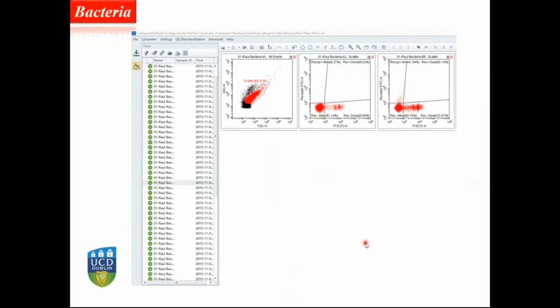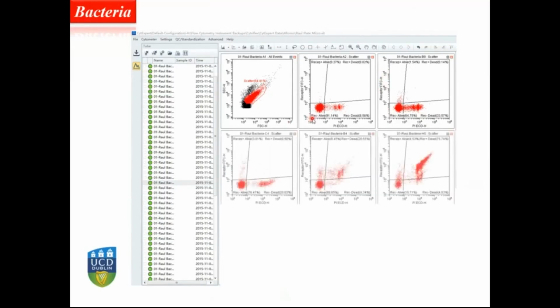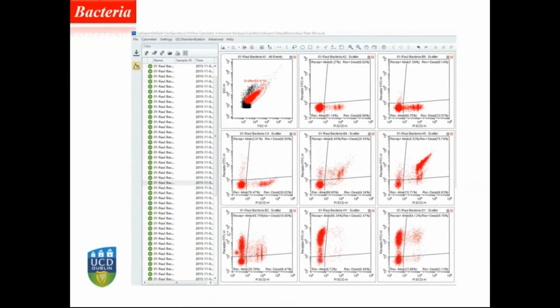So this is one example with my microbiology, where we analyze these different populations, looking at propidium iodide and the receptor of our interest, for instance. And what we have used is the CytoFLEX platform, and we have run this like in a 96 well plate. Okay, and we can see different profiles here showing the characteristics of the expression of these receptors, for instance, versus their viability.